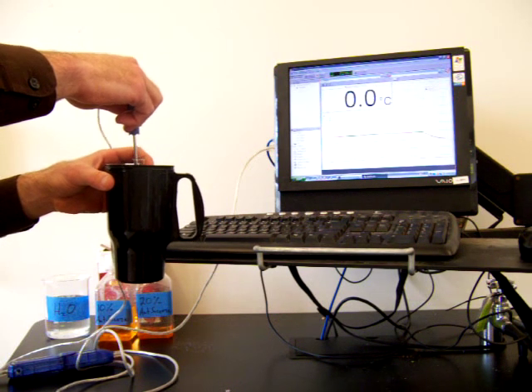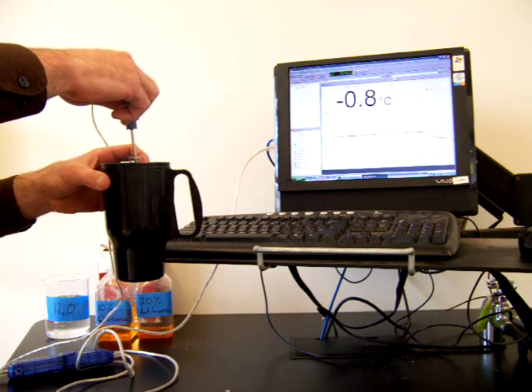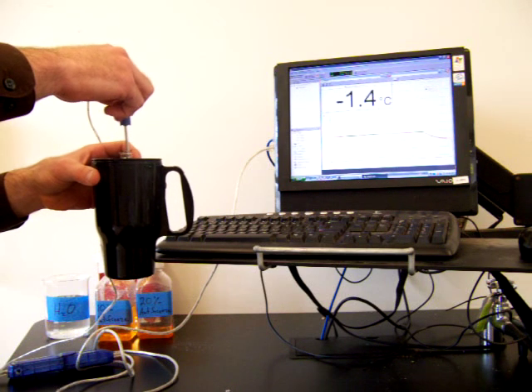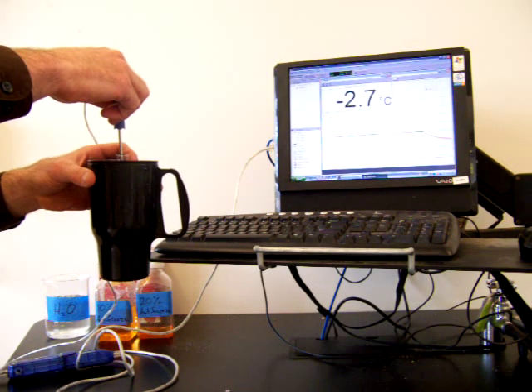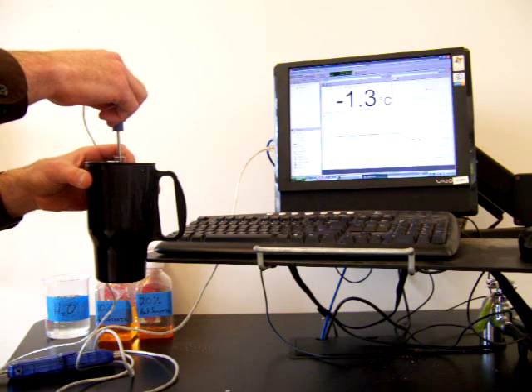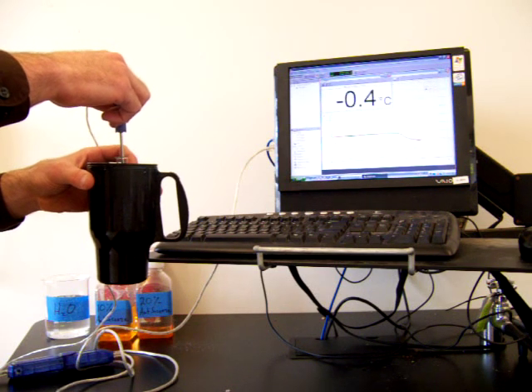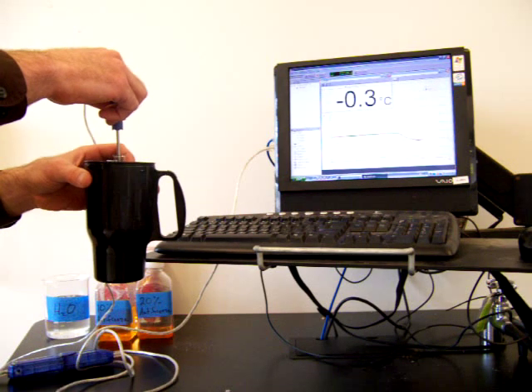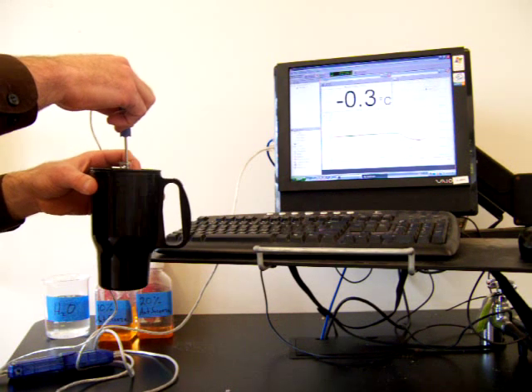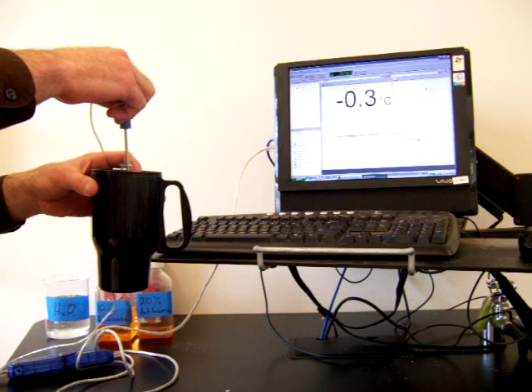So it's dropping pretty rapidly. We're at zero. So it's actually dropped beyond the freezing point of water. We'd expect water to freeze at zero degrees Celsius. It's actually dropping quite a bit below that. This is called supercooling. And we see it's coming back up. And this is as the freezing is occurring. It came back up and it looks like we have a freezing point of negative 0.3 degrees.